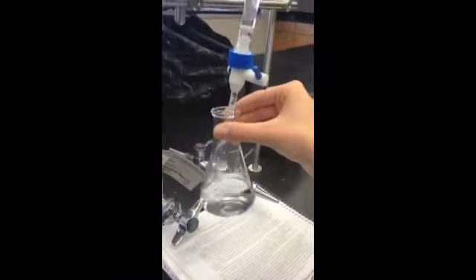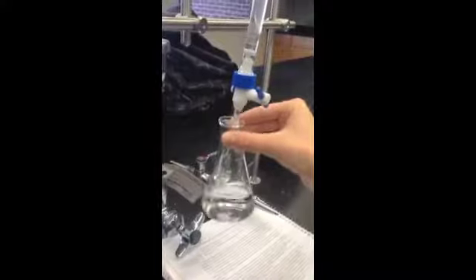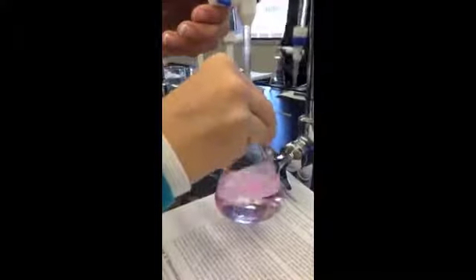It's important to move the Erlenmeyer flask around when you're putting the sodium hydroxide in the solution so that it gets distributed evenly. You know the endpoint is observed when it turns a faint pink in color. We performed this step for all 3 flasks, all starting with an initial volume of 50 milliliters.